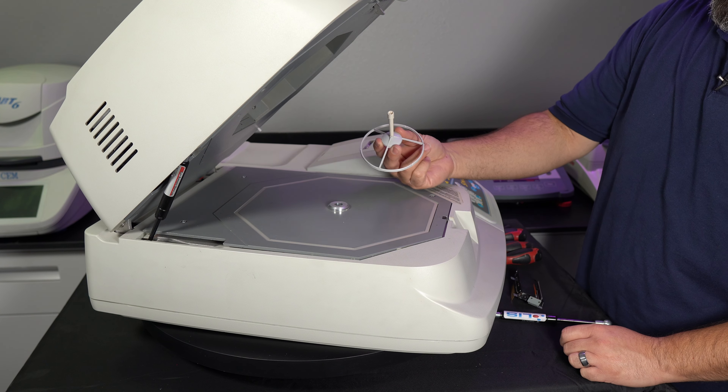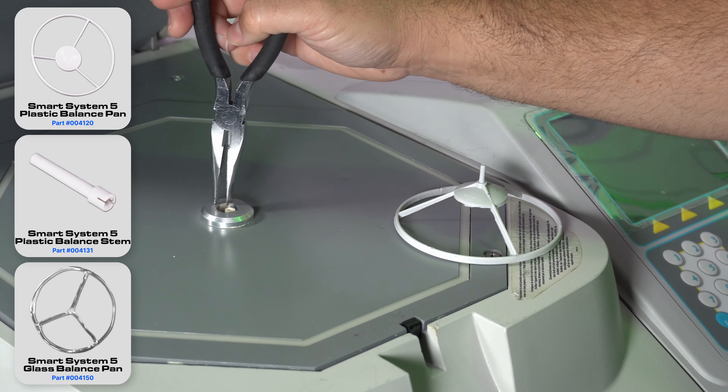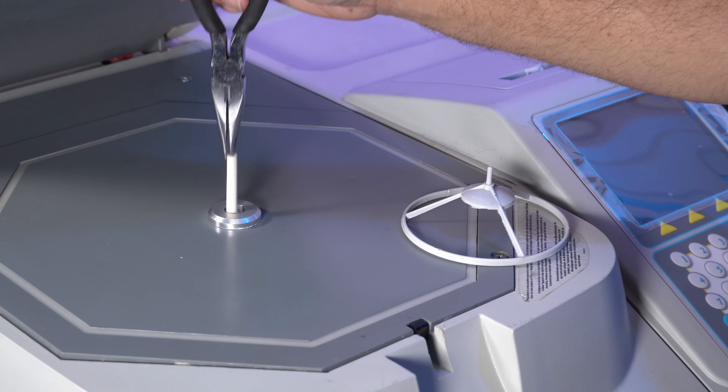Gently lift the balance pan straight up to remove it. If the stem does not come out with the balance pan, use needle nose pliers or tweezers to carefully extract it.